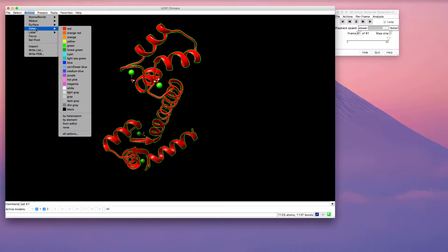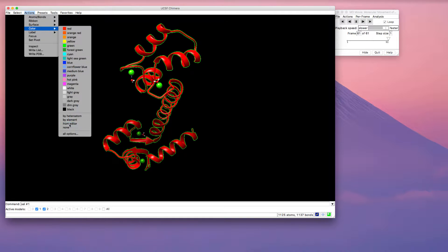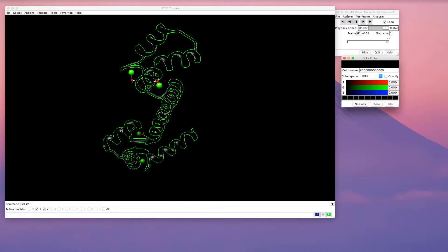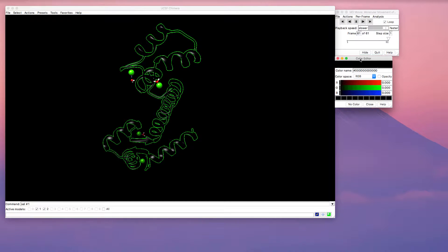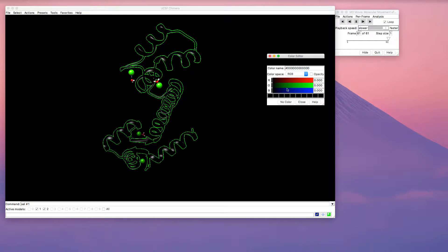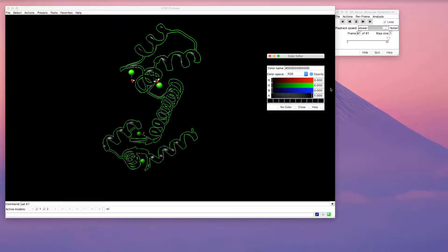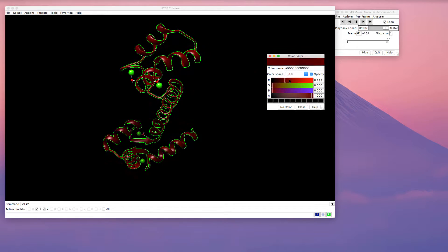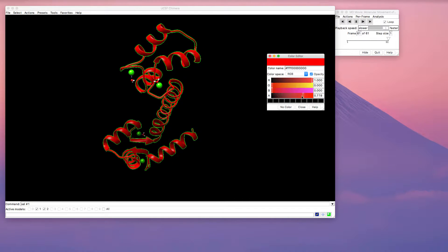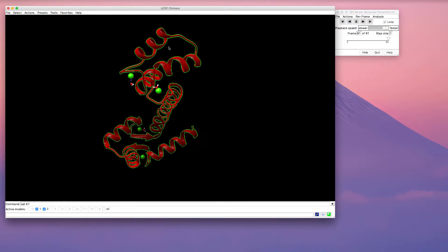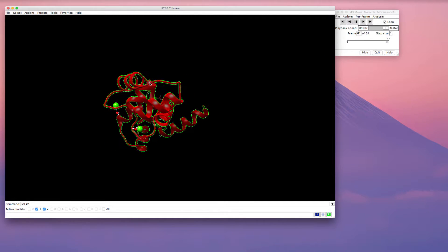So you can go to actions, color, and you can select the from editor option. This allows you to modify the colors. So here in the color editor, you have an option that allows you to control the opacity of the model. And the slider at the bottom allows you to make any color transparent.